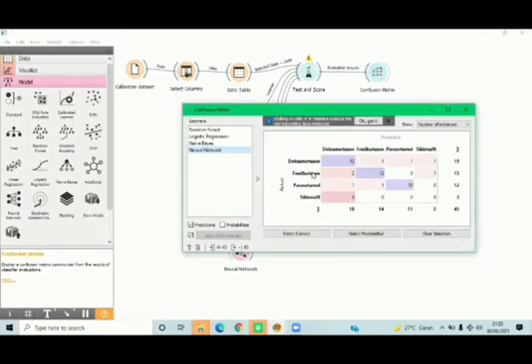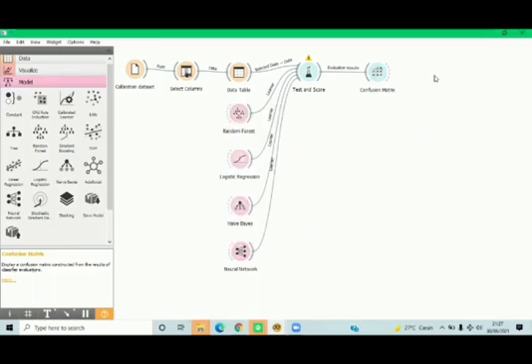We can also see in the confusion matrix that random forest is the better model to analyze the data. For dexamethasone, there are 13 data that can be analyzed, phenylbutazone 12 and paracetamol 11. After that, we click select misclassified, and then we can add a data table. So we already clicked select misclassified, so the data that we selected will show up in the data table.